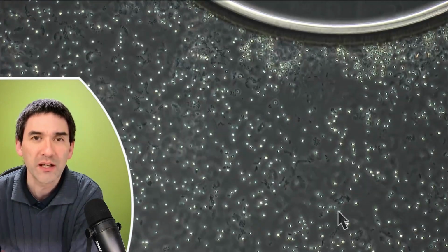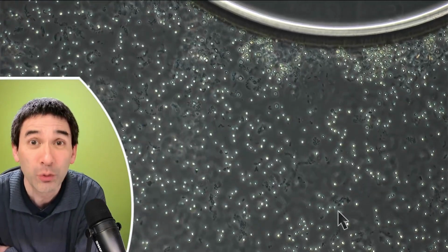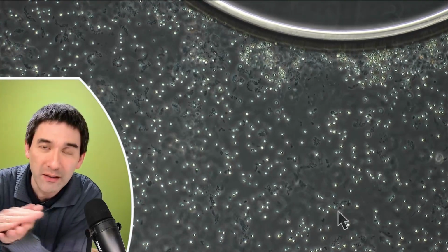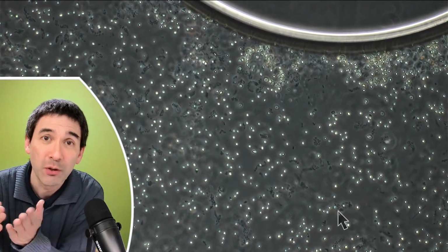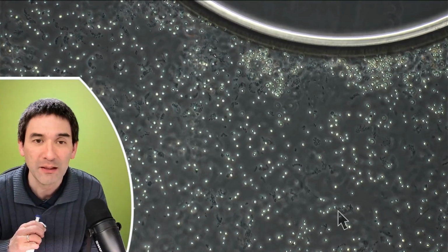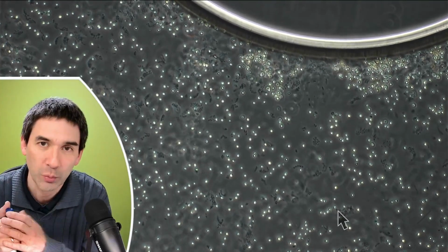However, the request was, can you tilt the microscope? I cannot do that, but I'm going to show you a different way. The reason why I cannot tilt my microscope to make the liquid flow into one direction is because my microscope is simply too heavy and I don't want to damage it. However, there is a little workaround, and actually there are several workarounds here.